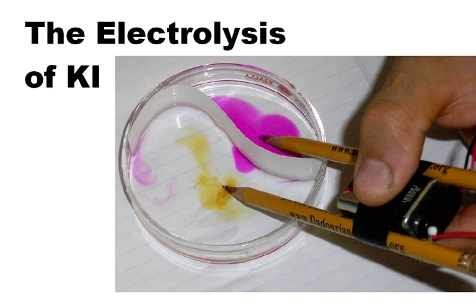I want to go over the idea of the electrolysis of a solution of potassium iodide. Here we have a petri dish with water and potassium iodide dissolved, and we've also added a little bit of phenolphthalein. We're using a 9-volt battery as a power source. The red wire is hooked to this pencil, making this guy positive, and on the other side, the black wire is hooked over here, so that guy is negative.